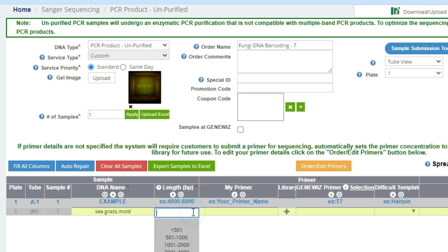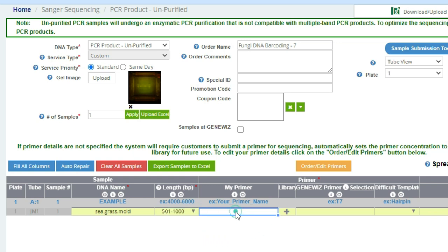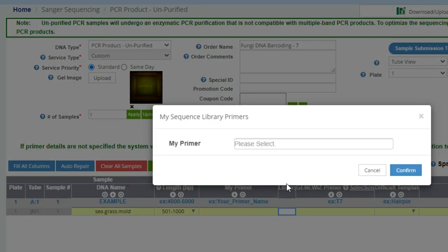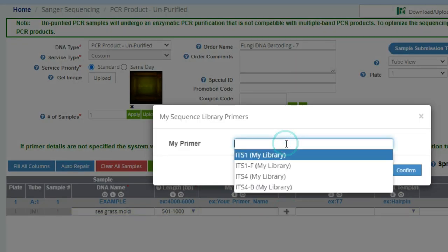Okay, so now we need to enter in a DNA name. I'm putting in seagrass mold. The length, which we know from running the gel, is between 500 and 1000 base pairs. And then we need to select the primer.